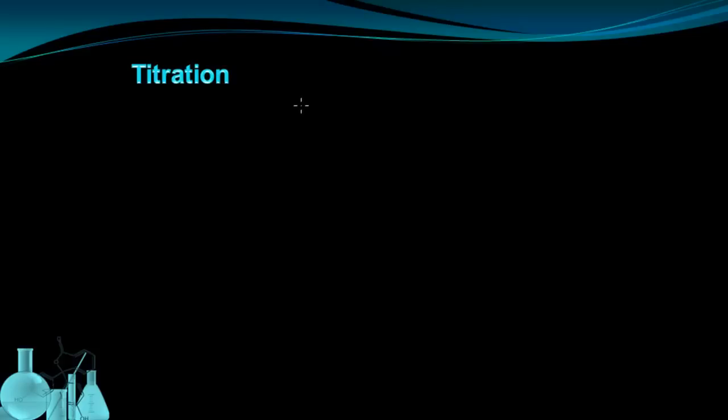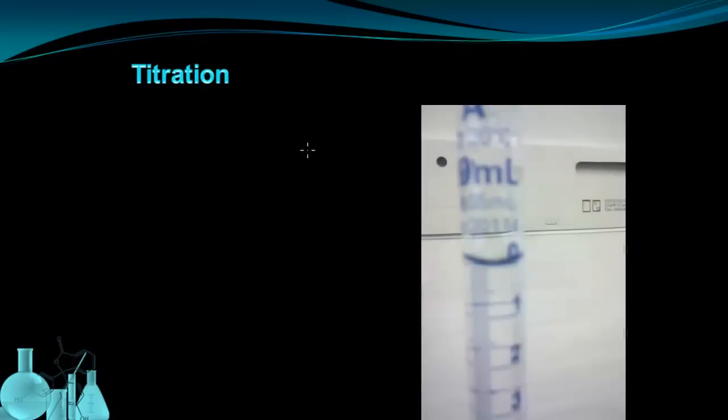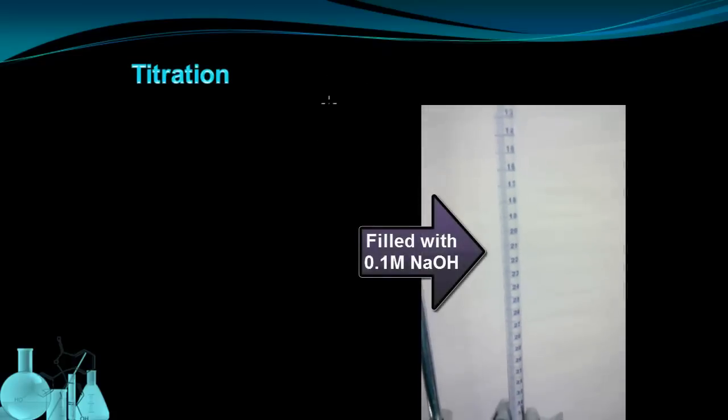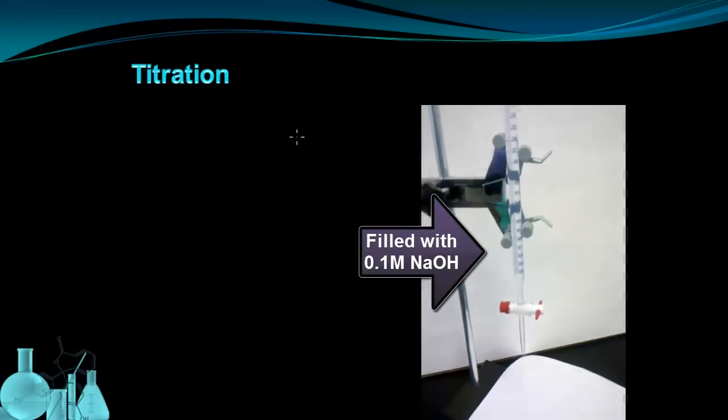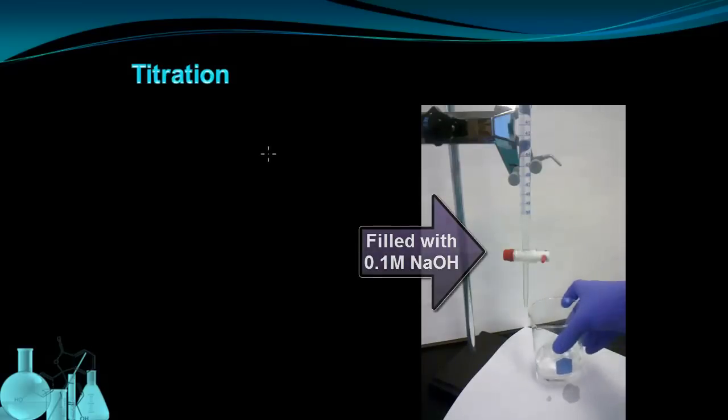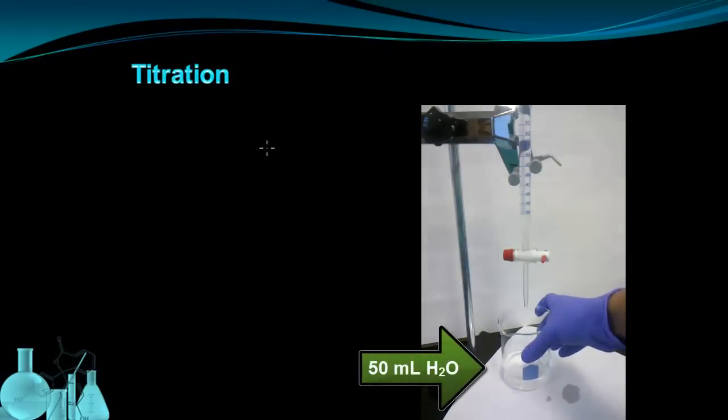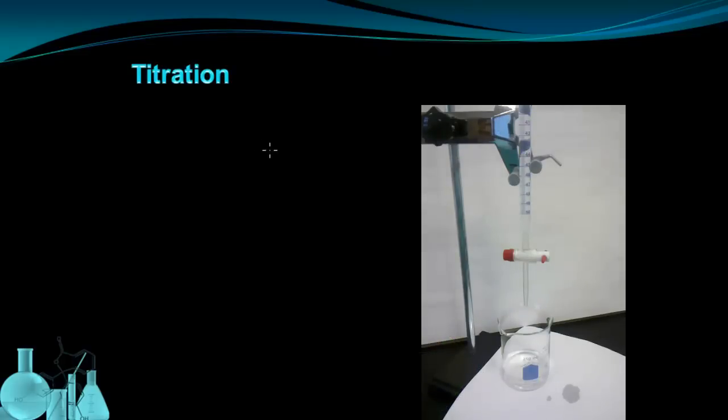Now that we know the features of a burette, let's look at the setup for the titration itself. I started by filling this burette to the zero mark with our known concentration base. So the 0.1 molar sodium hydroxide is in this burette. The next thing I'm going to do is place a beaker containing about 50 milliliters of water under the burette. You could also use an Erlenmeyer flask. And then I'm going to add 5 milliliters of my unknown concentration acid.